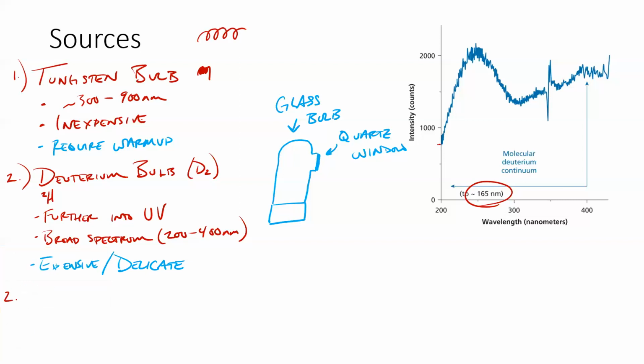The last two types of sources are much more common these days than they were even 10 years ago. It's a push towards less expensive materials, while these less expensive materials are becoming better and better at the same time. A few factors are leading this. The first is LEDs. LED stands for light-emitting diode.